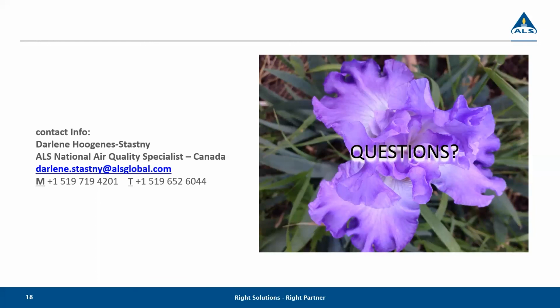We have a question from Rui. If the final vacuum pressure received by the lab is 0 Hg, and the starting vacuum is 30 Hg, does that always indicate an invalid sample?